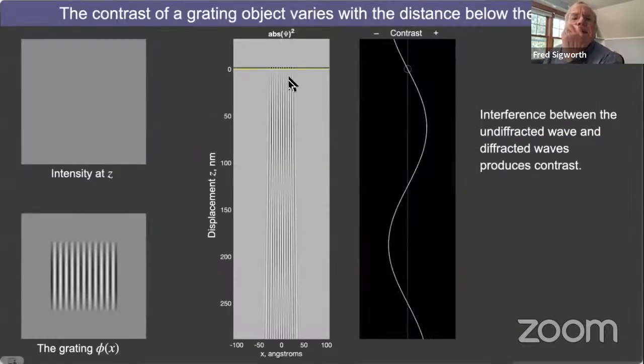You can kind of see them here. So here, the incident waves are coming down, and then you see something going on where at a very fine, very weak angle, very small angle, you can imagine 2 different diffracted waves moving like that.